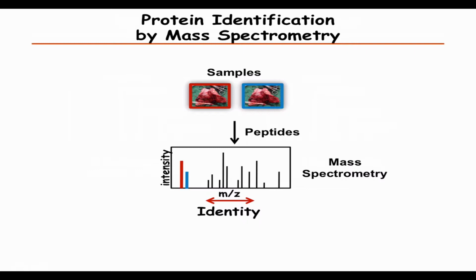So identification, we can measure them. Modern mass spectrometers can measure masses down to a few parts per million. So we can get very accurate mass measurements, both on the peptide and on its fragments. But we still don't know, when we have a fragment mass spectrum, if the charge is on the N terminus for that peak or the C terminus. So we always have this ambiguity of whether it's a B or a Y ion that we need to resolve.